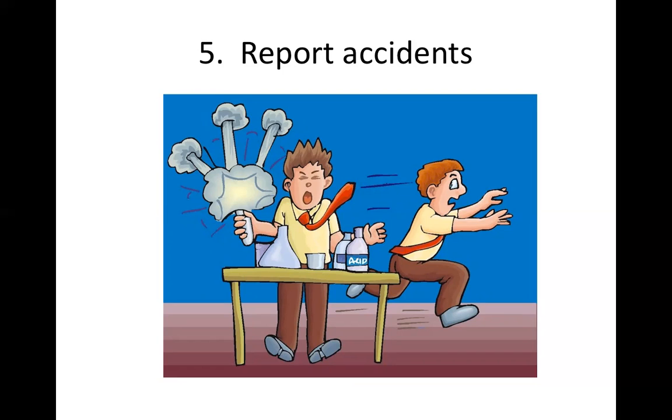So for example, you broke a beaker and you were afraid that the teacher will scold you for breaking a beaker. You put it inside your bag. So it can cause other accidents to happen. So just tell the teacher that it was an accident, it was not intentional, but you broke a beaker, and then the teacher will help in the cleanup of the broken glassware. So these accidents, they happen. You have to inform us, because if not, further accidents can happen because of it.